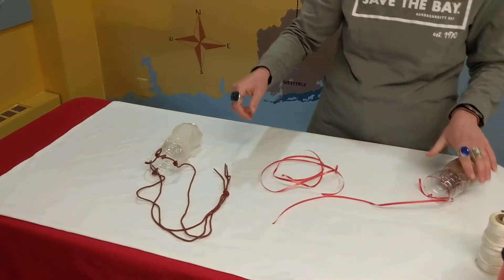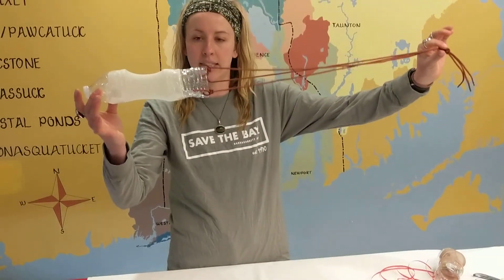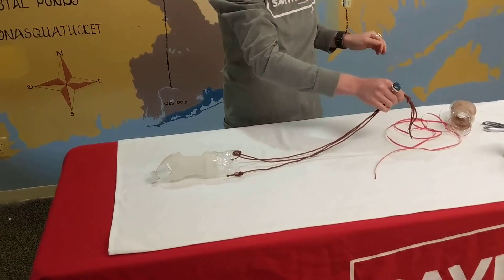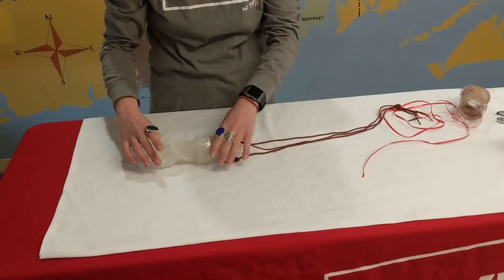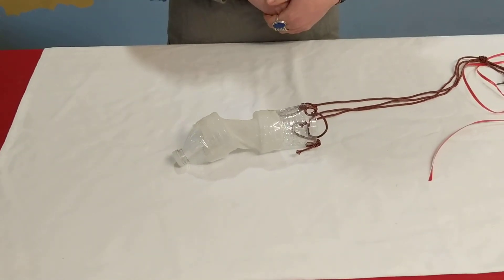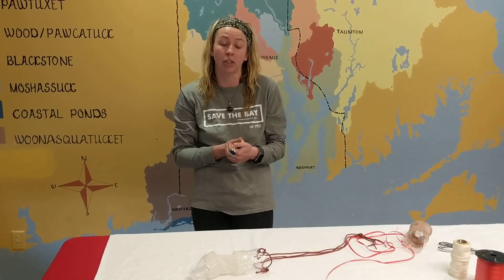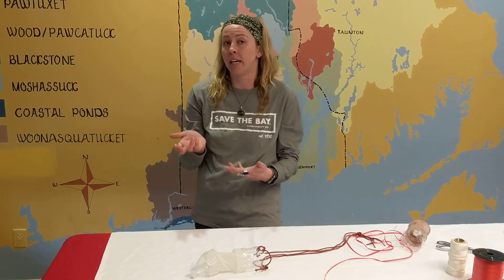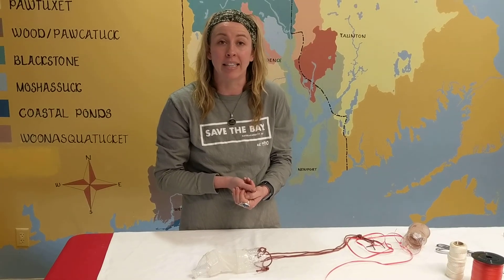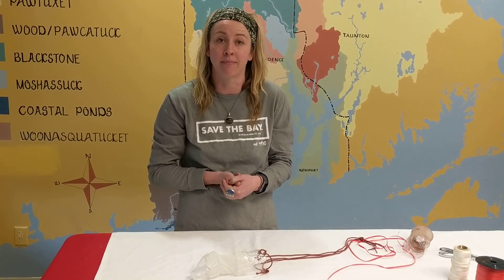I'll spare you the time of me tying everything and just show you the finished product. This is the plankton net that I made earlier. You can see that we have this tow line right here — that's what you would hold as you're pulling your plankton net through the water. All the water would go right in here, the water is released through the nylon, and the only thing that you have left in there is your plankton sample. So try this at home — see if you can catch any of those microscopic animals. If you check out our video that we posted earlier, there's actually a plankton guide linked in there, and you can go ahead and see if any of the plankton that you catch match the plankton that we commonly find in Narragansett Bay. Have fun!